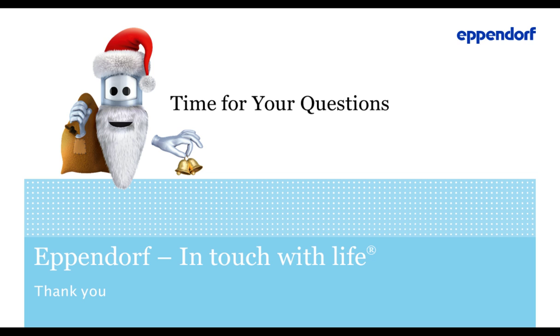Yeah, thank you, David. The next question I've chosen is a question that's related to antifoam. And the question is, you said antifoam is mandatory in fermenters when working with bacterial fermentation and high speeds. Is antifoam also used in shake flasks, Ines?